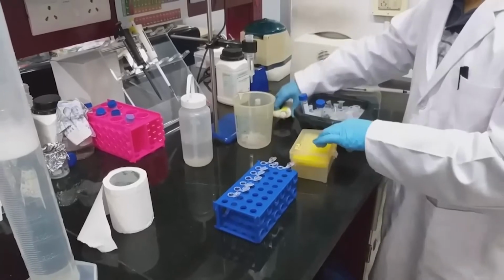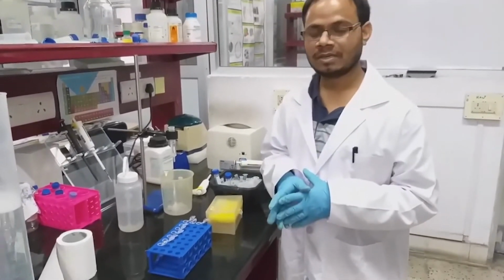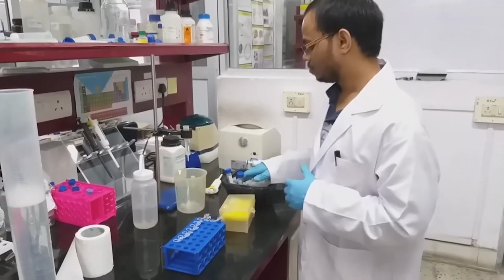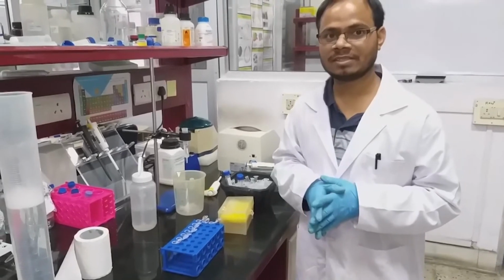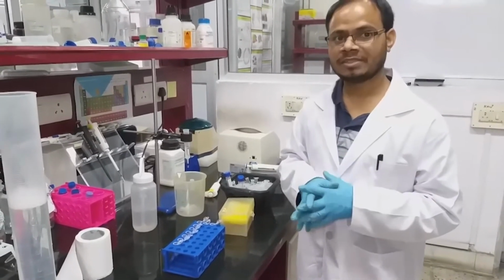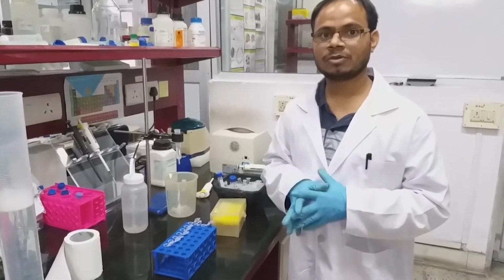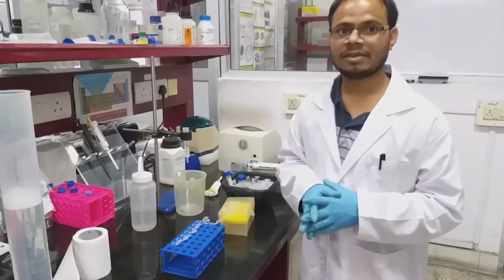We have to heat the samples before loading onto SDS-PAGE, and also we have to keep all the fractions we have collected at 4 degrees Celsius for further confirmation of the purity. Once the purity is confirmed, we have to dialyze those fractions against our buffer of interest, then use them for further studies.